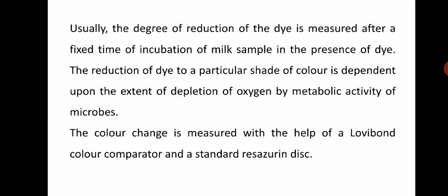Obviously, the reduction of dye depends upon oxygen concentration, and the oxygen concentration again depends upon the metabolic activity of microbes. The color change is measured with the help of a Lovibond color comparator and a standard Resazurin disc. So you can observe the color change with these two aids, the Lovibond color comparator and the standard Resazurin disc.